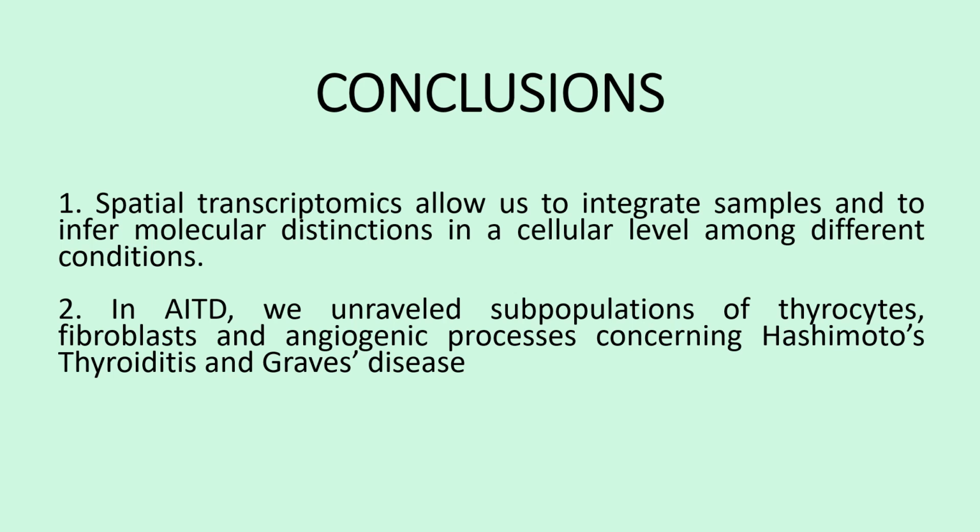To conclude, spatial transcriptomics allows us to integrate samples and to infer molecular distinctions at a cellular level among different conditions. In autoimmune thyroid diseases, we unraveled subpopulations of thyrocytes, fibroblasts, and angiogenic processes concerning Hashimoto's thyroiditis and Graves' disease.